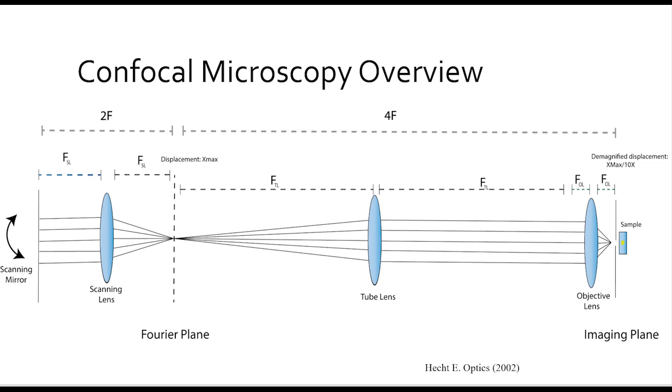Now, before we're able to step into the laboratory, I need to give an overview of confocal microscopy. So confocal microscopy provides high-resolution imaging to resolve detailed cellular structure at an exact plane of focus. Confocal microscopy achieves this through utilizing a small pinhole or aperture to focus the light and reject all out-of-focus light.